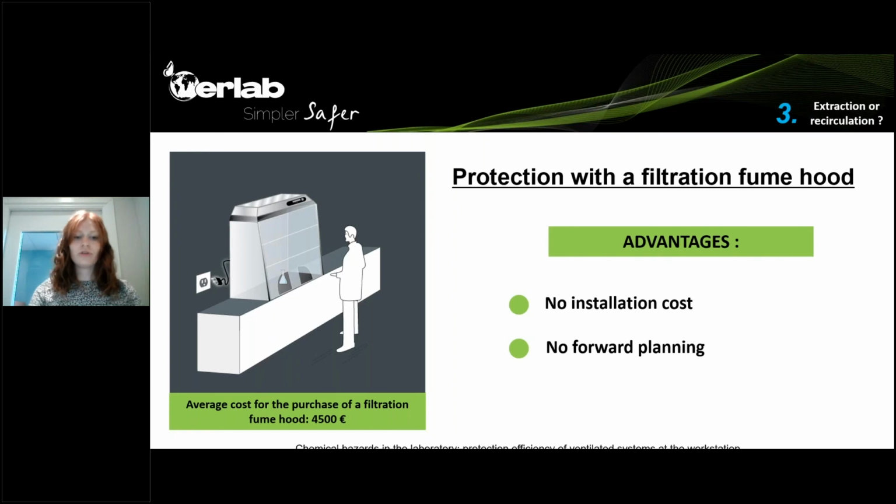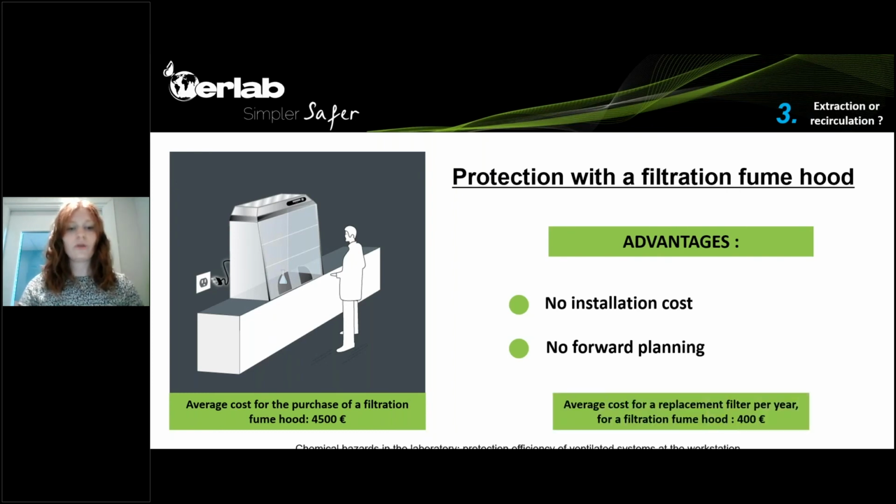The average cost for the purchase of a filtration fume hood is about 4,500 euros. The running costs are composed mainly of the filters that need to be replaced, around 400 euros per year.